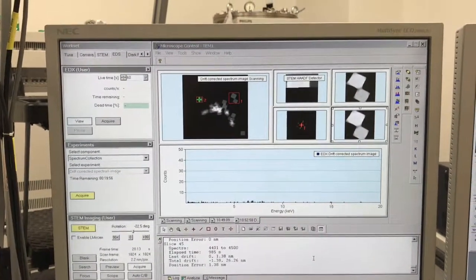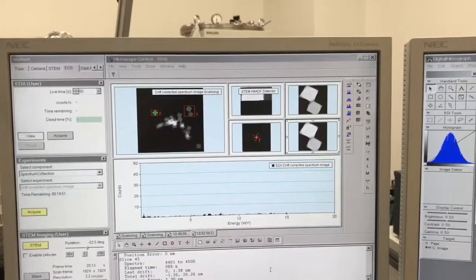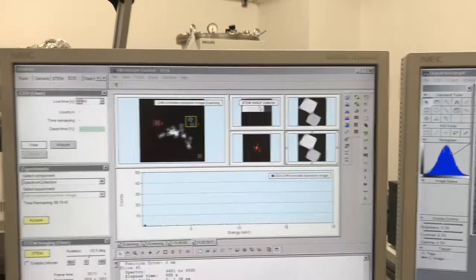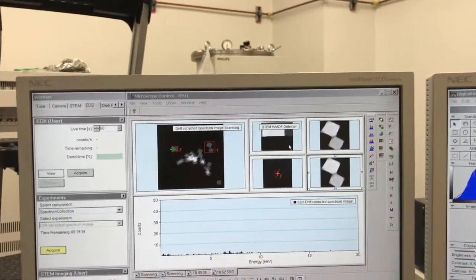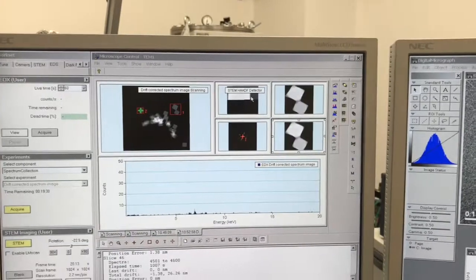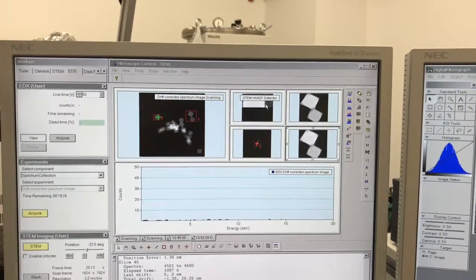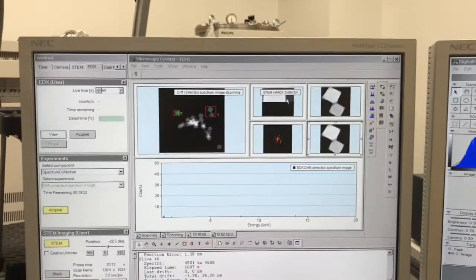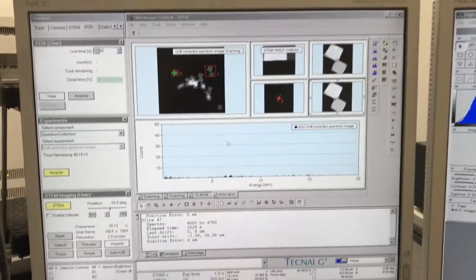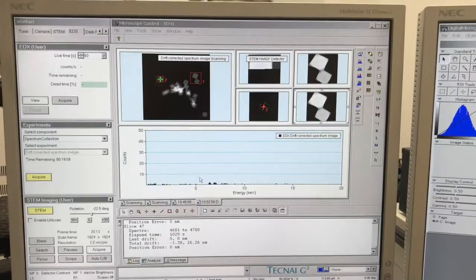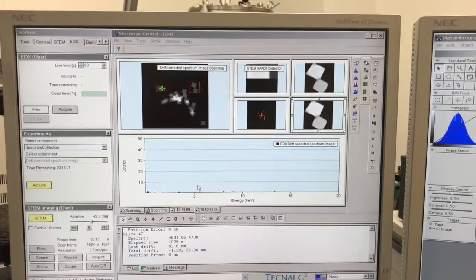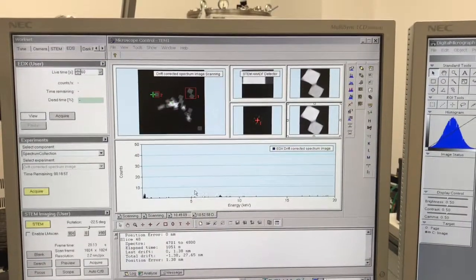Quick update: we're about midway through the map. This is the STEM detector signal, and you can see the image of the particle here — it is shifted over to the left from where we told it to do the map. I knew that was going to happen to some degree; it probably happened a little more severely than anticipated because we took a little long between when we started the map and when I did the image acquisition. It looks like we'll get the whole particle in here though and won't be cut off. I don't have a lot of counts at this point but we will be able to get a map from this.